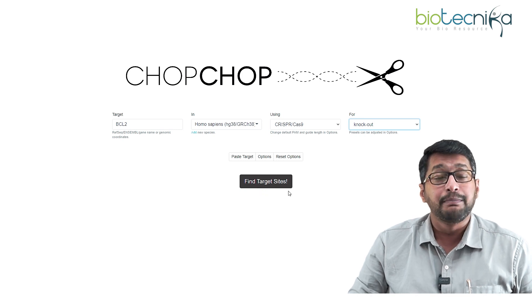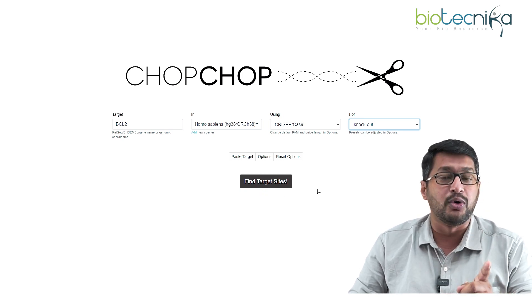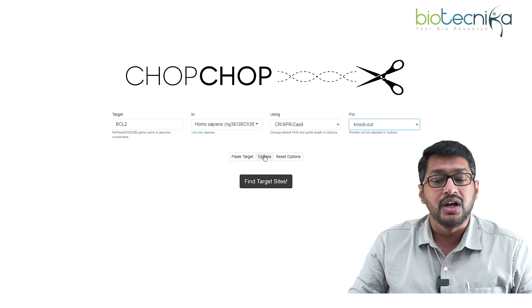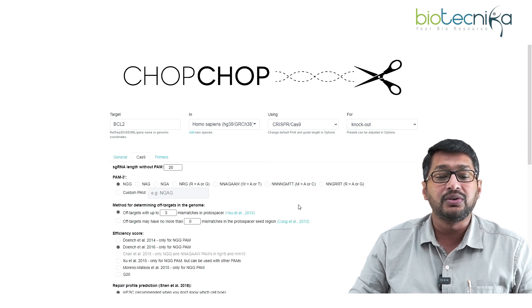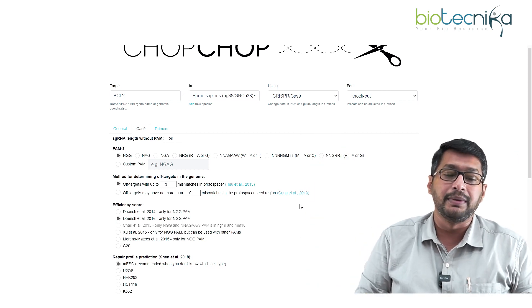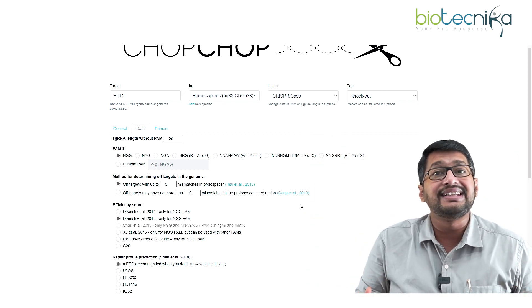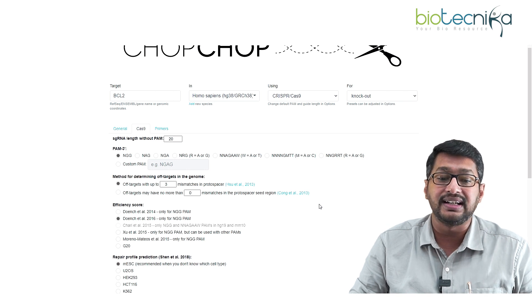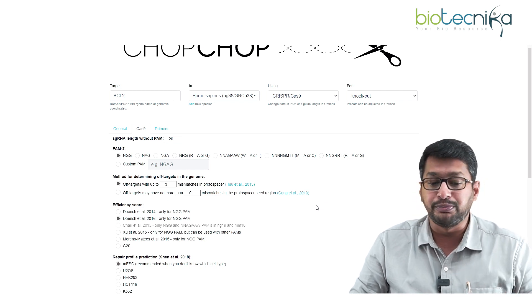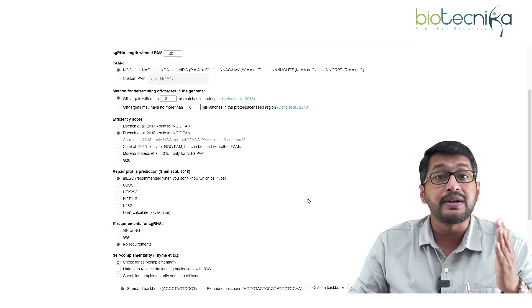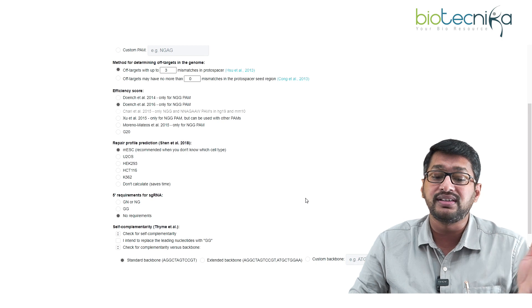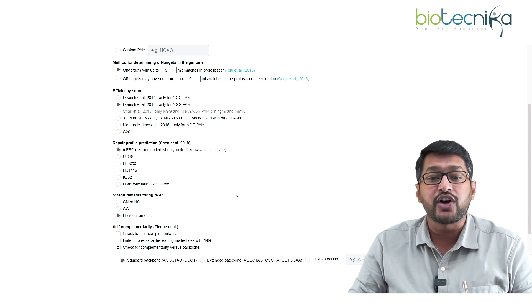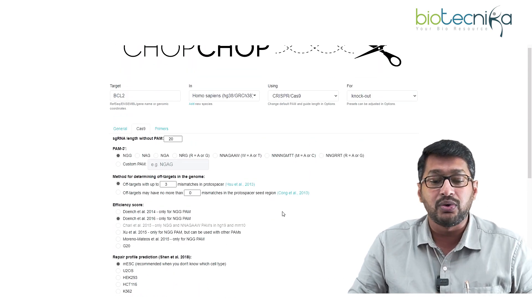You can run it on default mode or customize it. Clicking the 'Options' tab opens a series of settings where you can specify the PAM site, the length of your guide RNA, with or without PAM site, efficiency score, repair profile, requirements at the five-prime end, and whether there is self-complementarity — all depending on your research design.